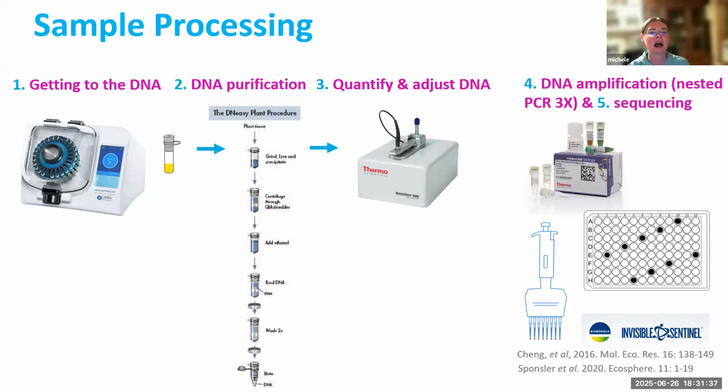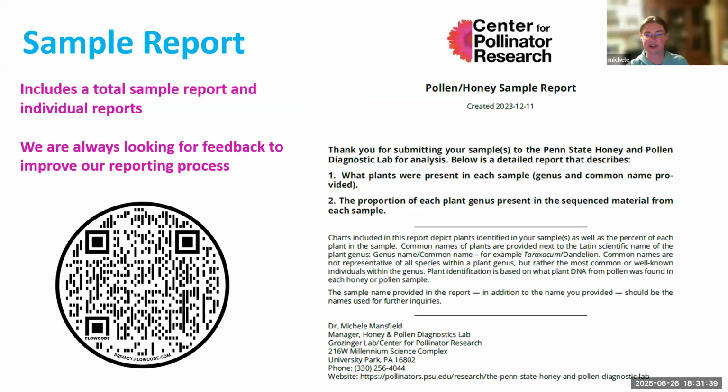And I work a little bit of magic. I'm not a programmer, so learning how to use some of the data analysis side of things was a little bit challenging. But the final part of the process is that I get that DNA back and we run it through a data analysis pipeline. That pipeline does several things.